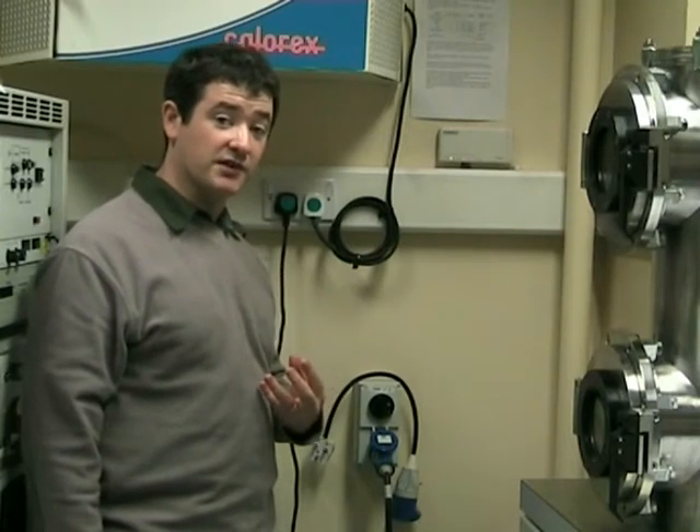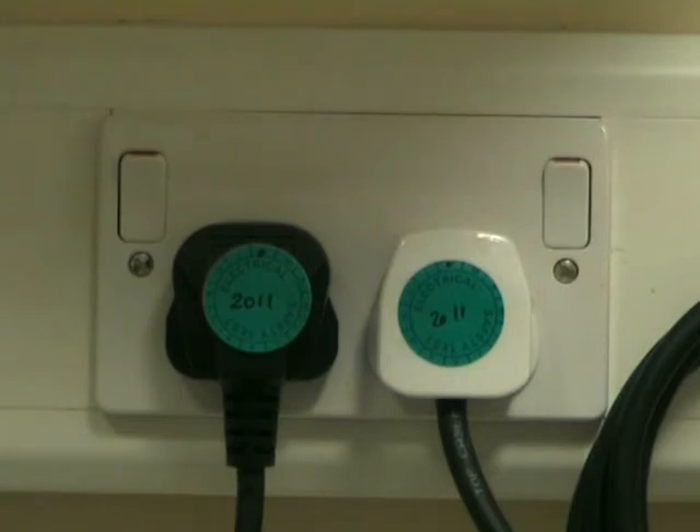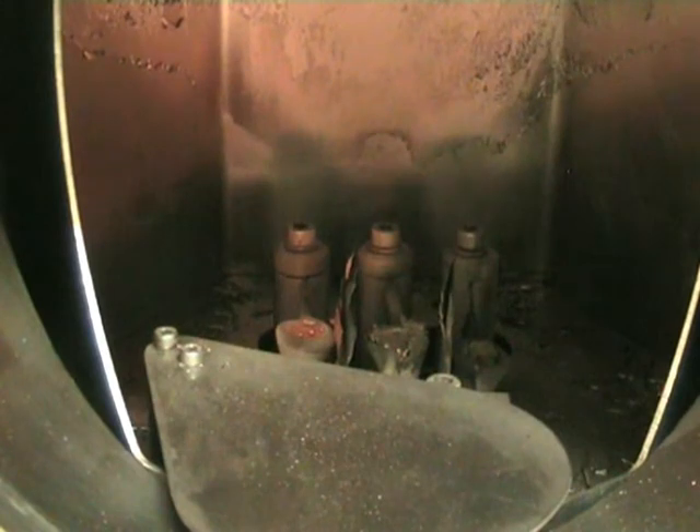Before you can load samples into the evaporator, you need to vent the chamber to activate. To do this, turn on the compressor at the wall. The compressed air is used to slow down the turbo pump during venting and also to operate the shutter above the crucibles.